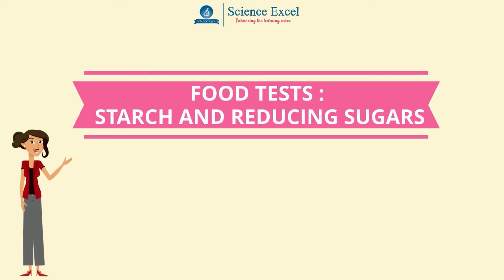Chemical tests can be used to identify several important constituents of food like starch, sugars, proteins, and fat. This tutorial introduces you to the tests which can be used to detect different food constituents.